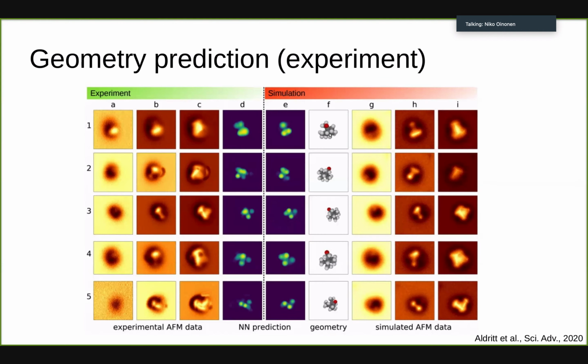So we took a whole bunch of different directions of this particular molecule, where we can compute the descriptor that corresponds to those configurations, and then we matched the experimental predictions to the reference ones that we have. There are 500 different ones of these, and of that set we found the best ones.